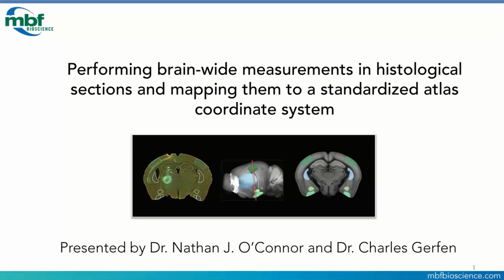First, Chip is going to give some scientific context, and then we're going to run through the specifics of the workflow that we've developed in our NeuroInfo. So today's webinar is going to be an outline of the basics of our workflow, and provide some context. We've already got follow-up webinars that we're scheduling that will go into specific details of workflow steps.